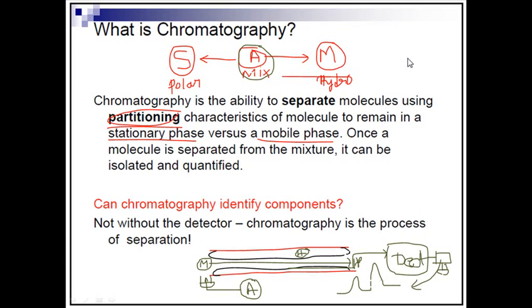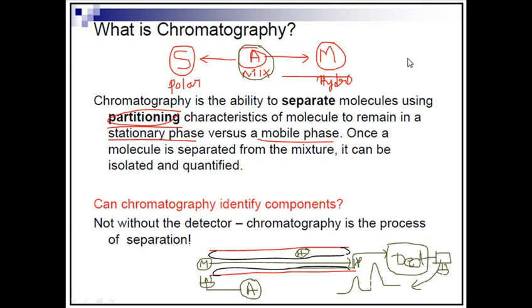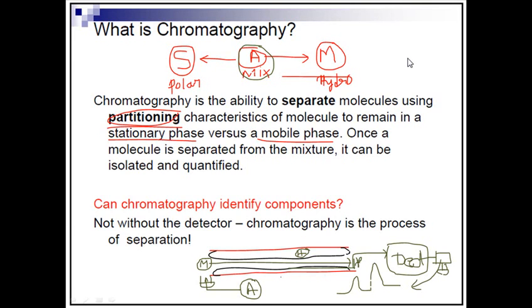This curve is called a chromatogram, because this is the written or listed form of our recorded data. By looking at this chromatogram, we can say about the property as well as the amount of those analytes that are present in the mixture. So we can both quantify and analyze qualitatively.